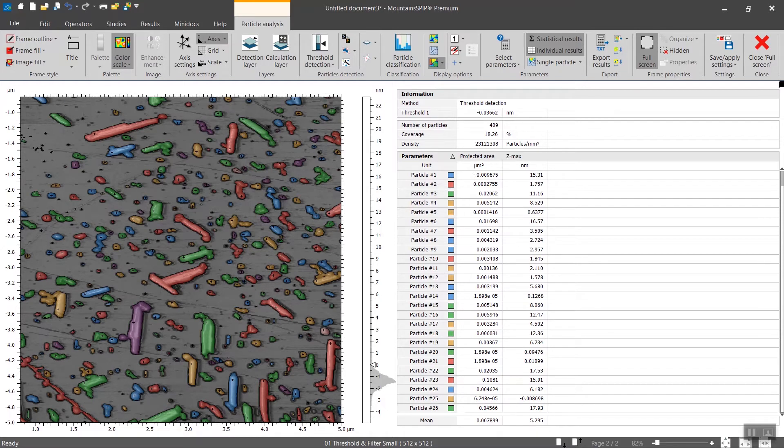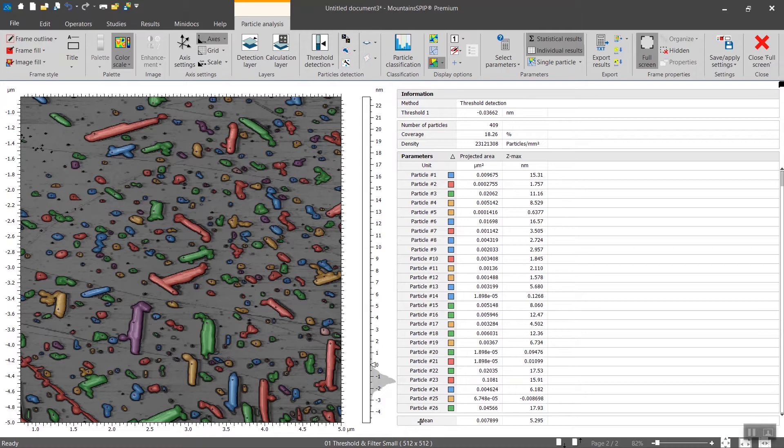In this case they are the projected area and the Zmax. And finally the last section is a bit of statistics. In this case we calculate the mean of the projected area and the mean of the Zmax.